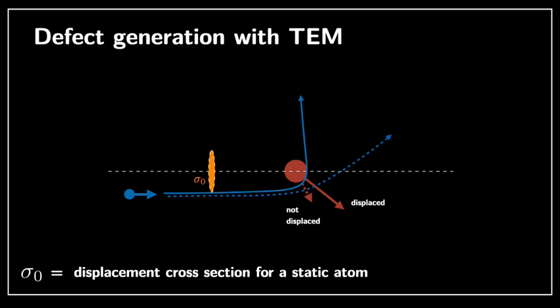In this case, if you just look at the classical or real space view of the cross-section, if the electron starts from the surface sigma naught, it will be deflected. Of course, this displacement depends on the velocity, it depends on the energy, and the chemistry of the material as well, but this is the idea. When people talk about understanding sputtering in any material, they're really talking about finding what this cross-section is. This picture should be pretty familiar to many people from Rutherford scattering. This is very much the same idea here, which is really a classical collision type of thing.